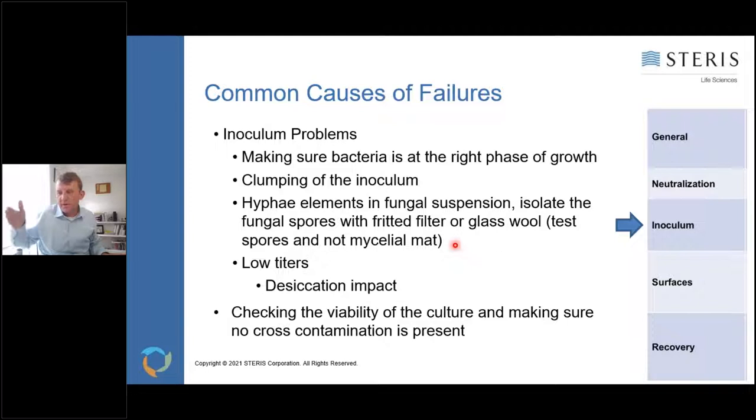And you want to watch your titers, make sure you have adequate challenge. Some microorganisms are very sensitive to drying. So a Pseudomonas that's used to a wet, watery environment, for example, or even a Candida yeast, does not like to be dried on a hard surface. So you may start with a good challenge, but after that drying process, you might end up with too low of a challenge to evaluate in your study. And then, of course, you want to make sure that you have a good, clean culture that's not contaminated, that you don't have something else in there, and that you're testing what you're looking for.